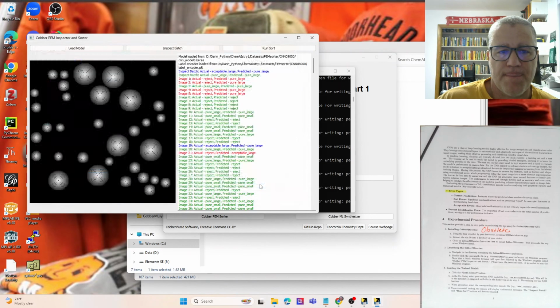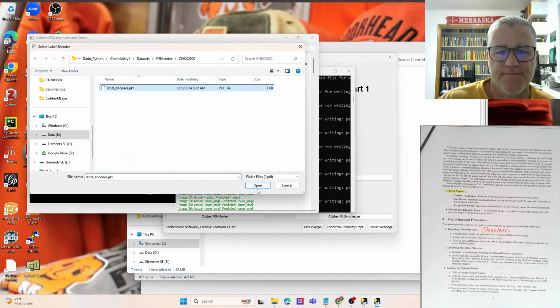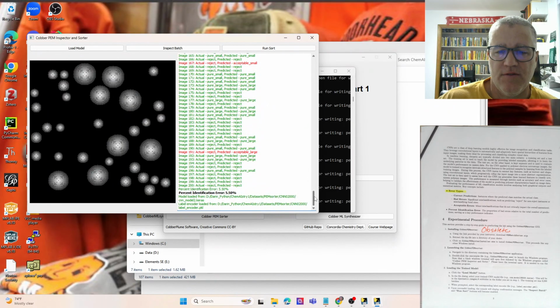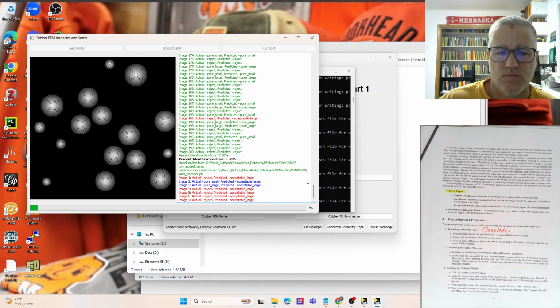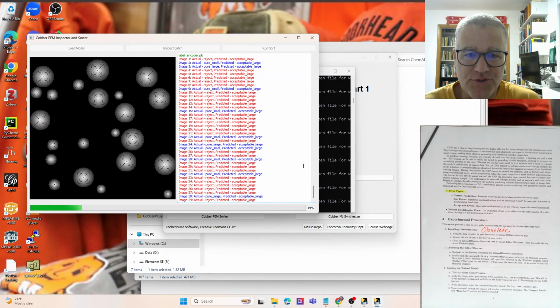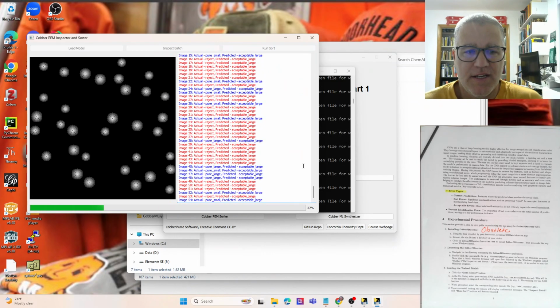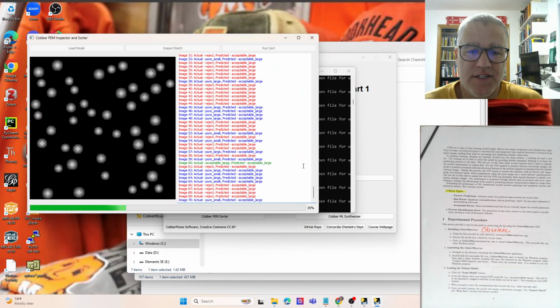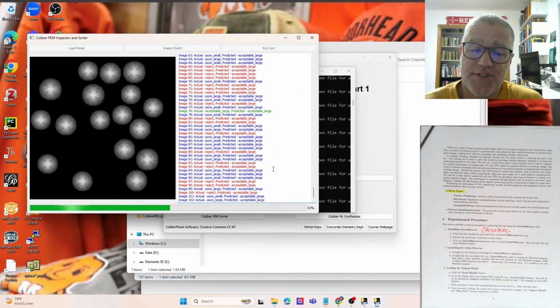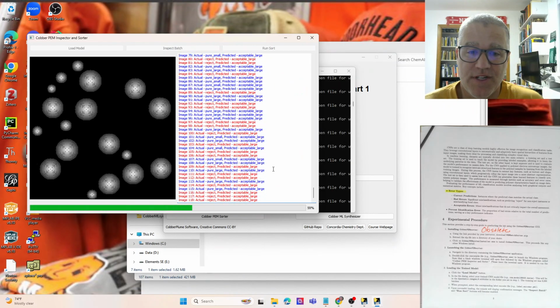So there's the Keras file, and then we will get the pickle file. And let me go down here now, and we will see we'll get much worse results. A lot more red coming up here, almost no green. And all this is just a different model looking again at these. So here's the first green. So big difference going from 2,000 pictures to 8,000 pictures.